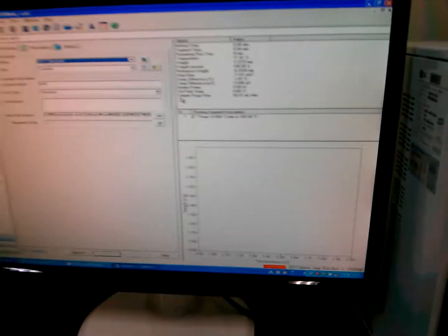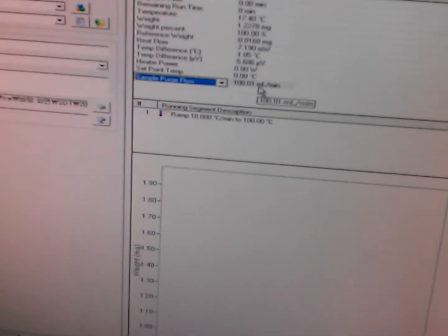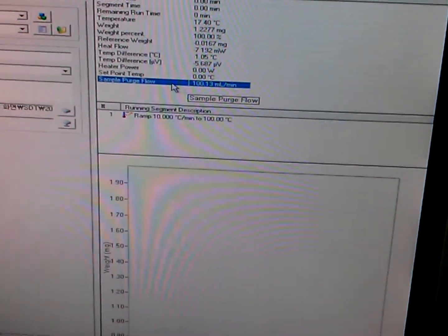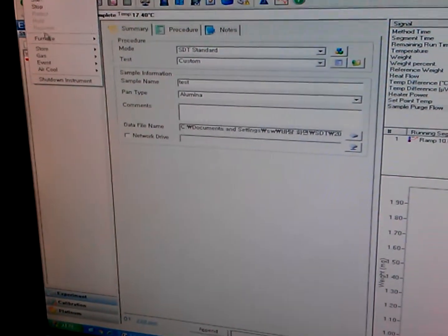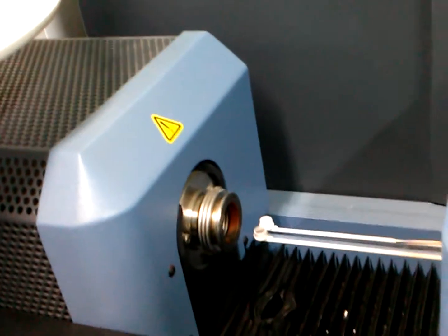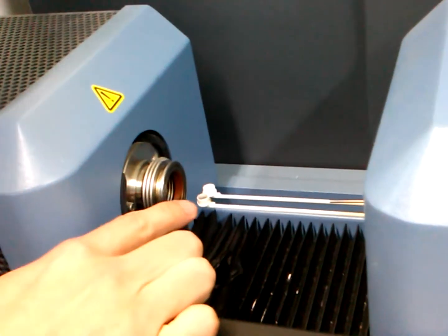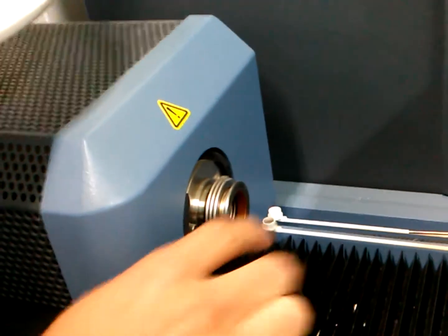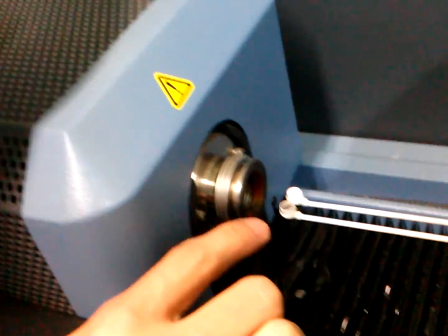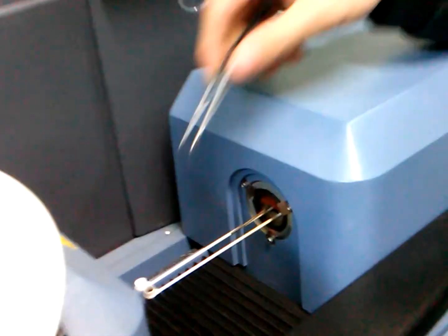First you have to check the sample purge flow, so it must be 100 milliliters per minute, and then you can open the furnace. Usually in this furnace there is a sample cup on this side — the white one is the reference, and this is your test sample. Usually there are some samples, so we must clean.